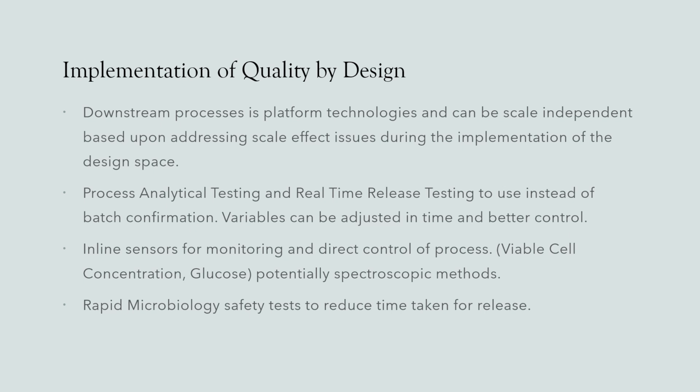So yeah, this is what I was talking about earlier about scale effects and incorporating those in your design space, if that's possible. If it's not possible, and if you haven't done that, then you would need to do the required additional scientific and maybe even clinical and non-clinical data generation in order to justify your scale up.